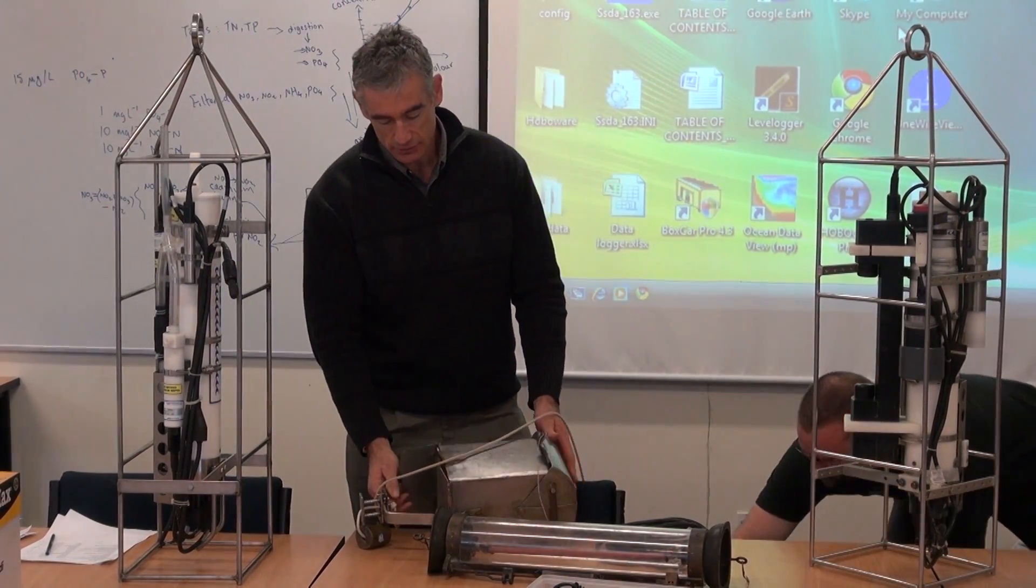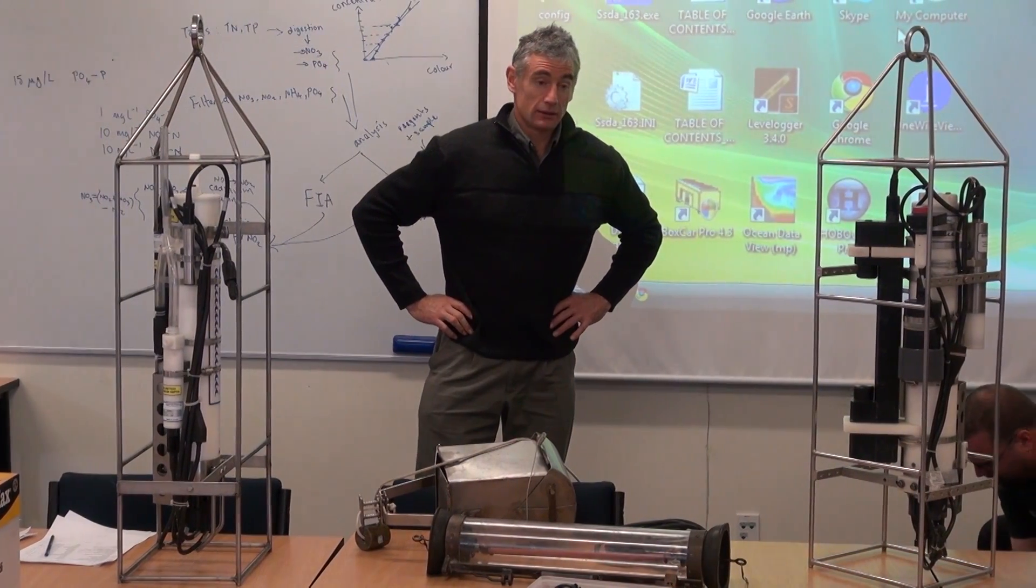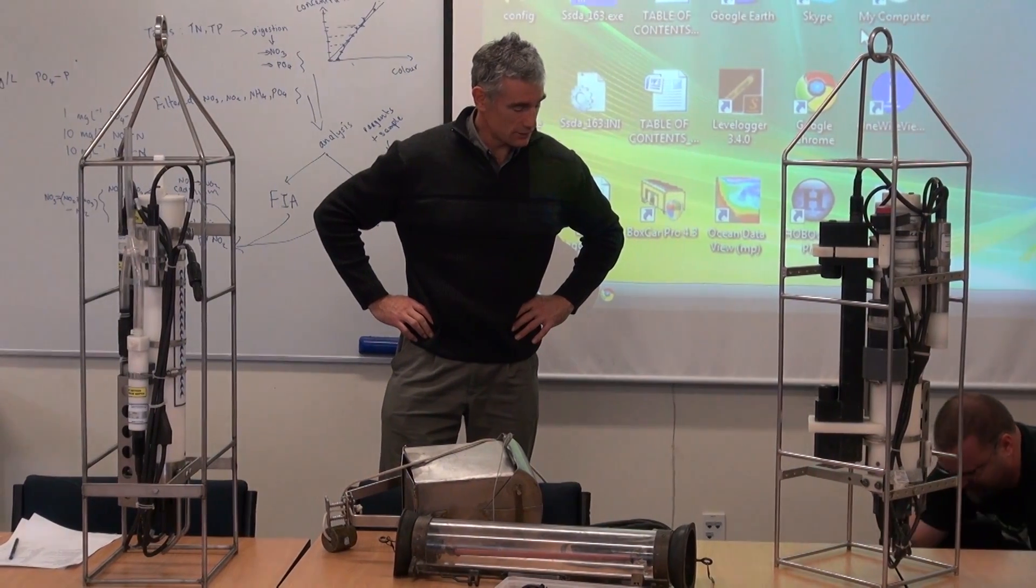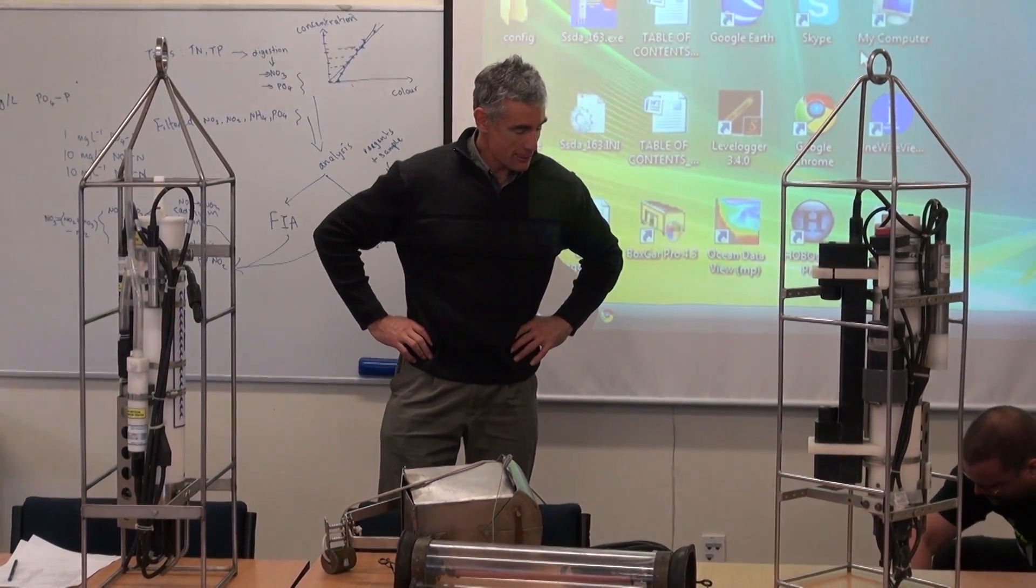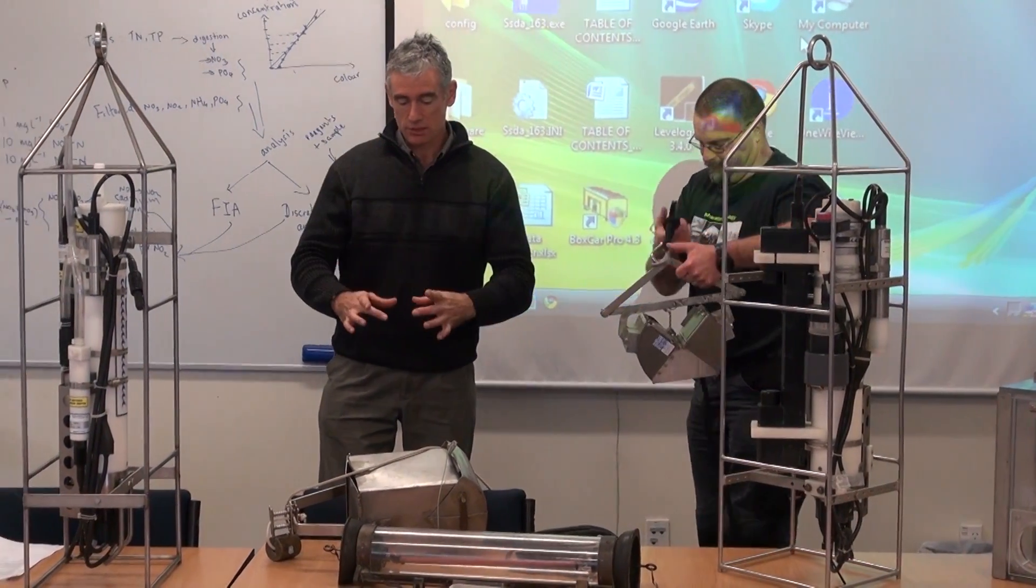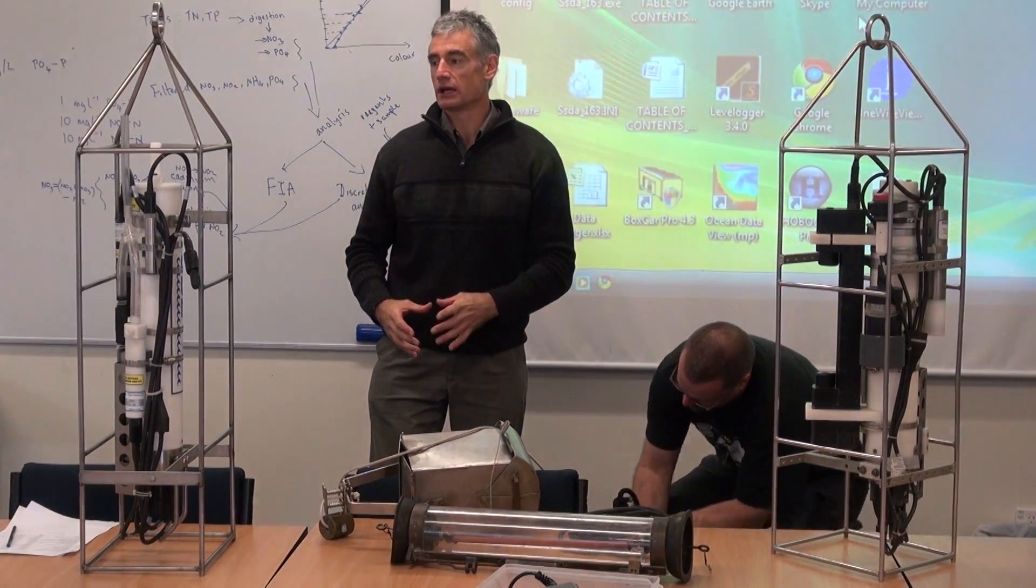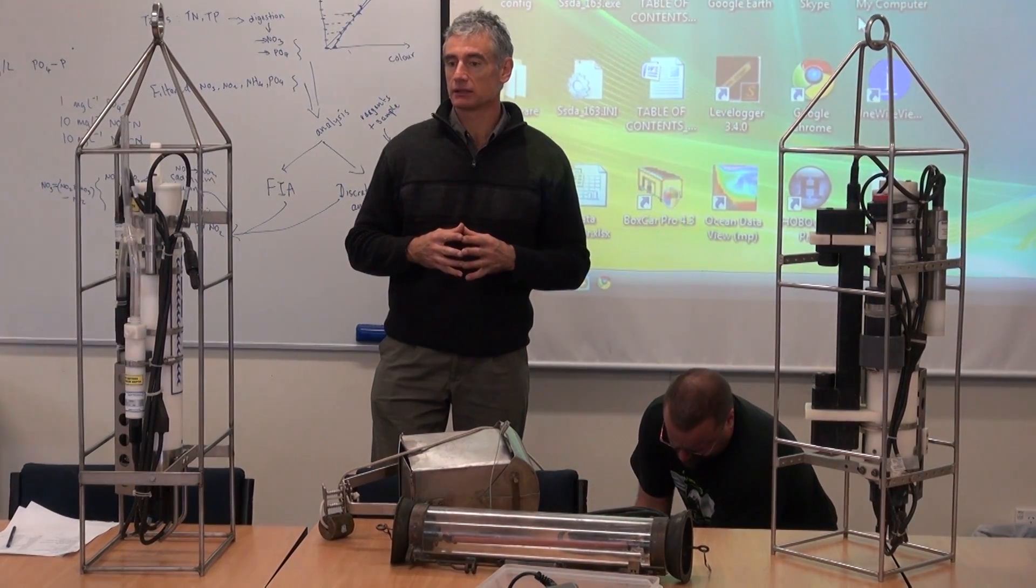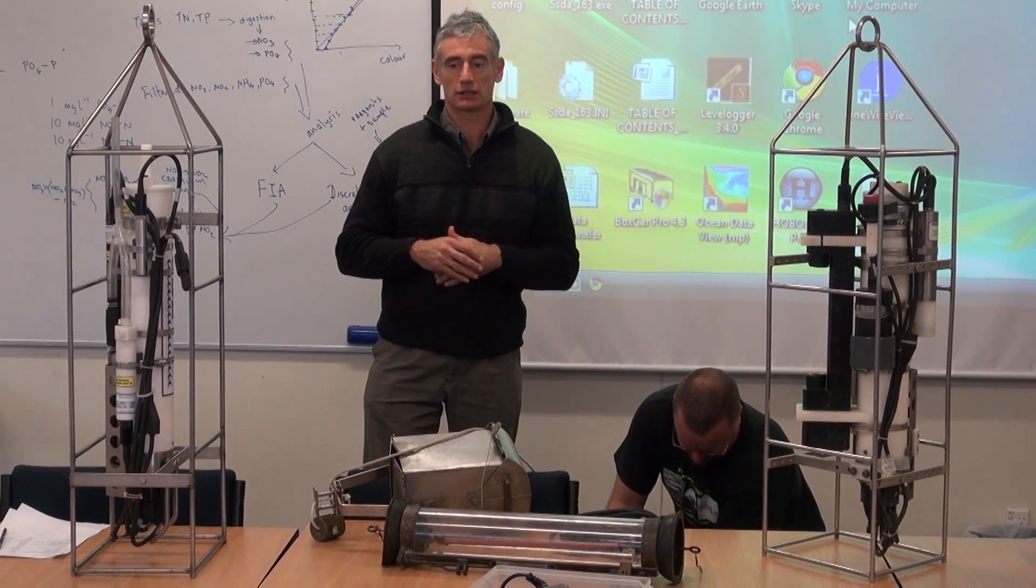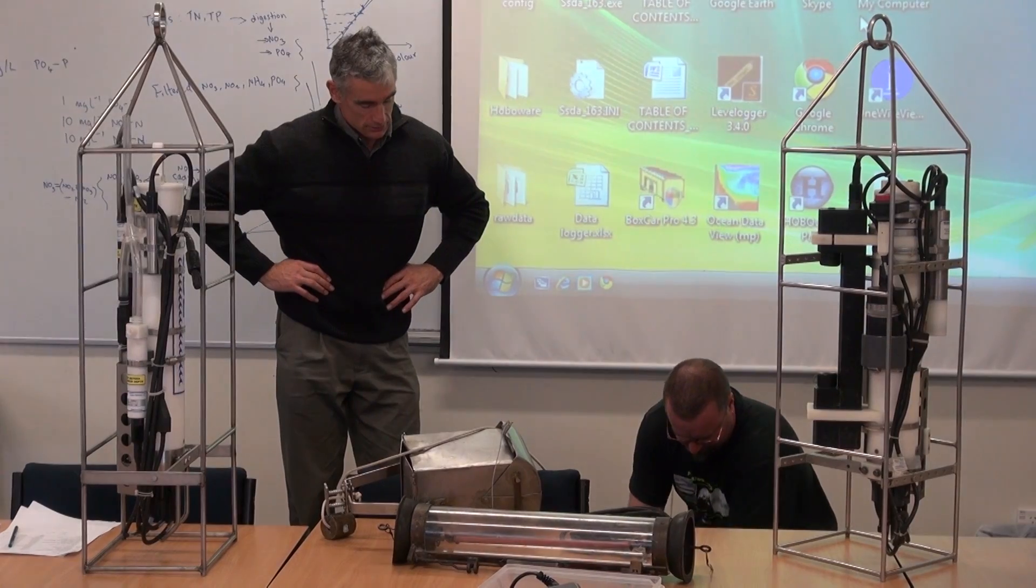My sediment is Swedish gravity corer, and the Swedish gravity corer is basically a perspex type thing that is put down and will raise up your sediments so that they're intact. So if you're interested in layering and quantitative samples of sediments, then the Swedish gravity corer is the one that you want to use.